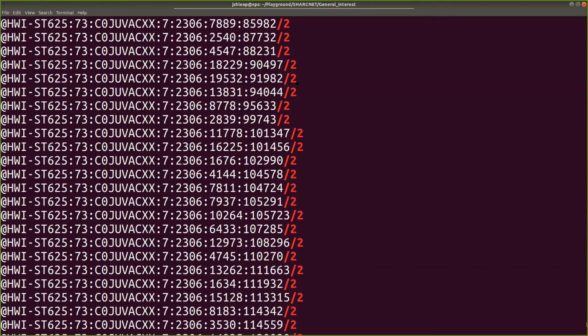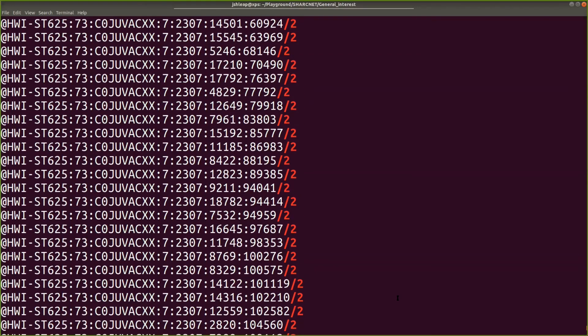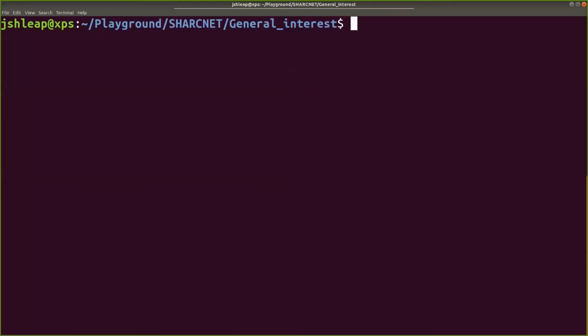Because we know that this pattern exists. If you do not know and you are working with a Fastq file, then one option is to just print the number of lines divided by 4, right? Because we know that most Fastq files have 4 lines per sequence. So let's see if we can do that.